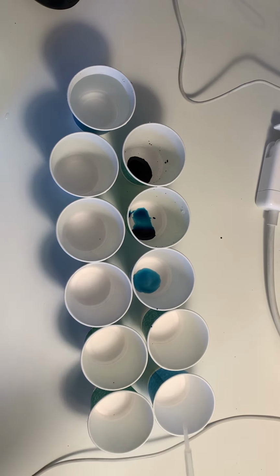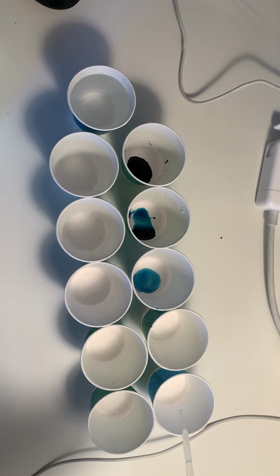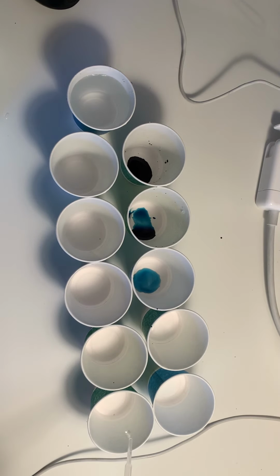Now I know I'm going to add 9 drops to all of these, so I'm actually going to go through and do all the water. 1, 2, 3, 4, 5, 6, 7, 8, 9. Gotta get more water.